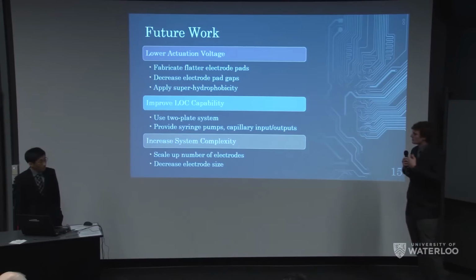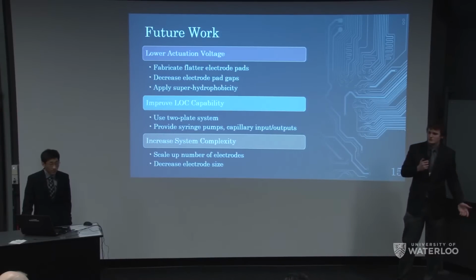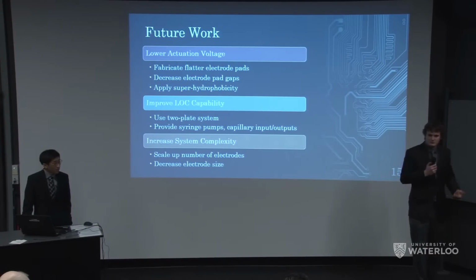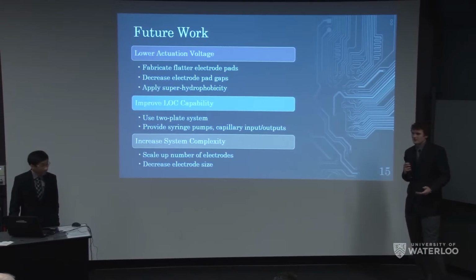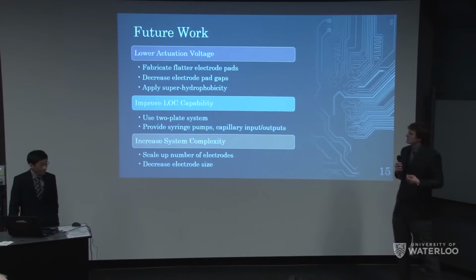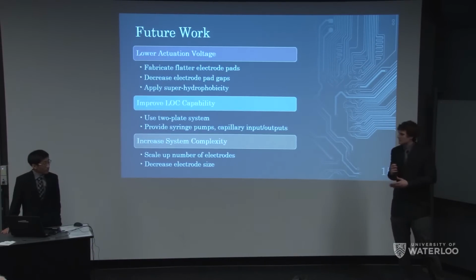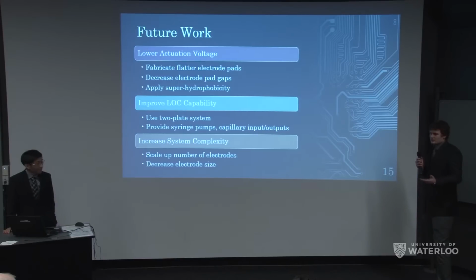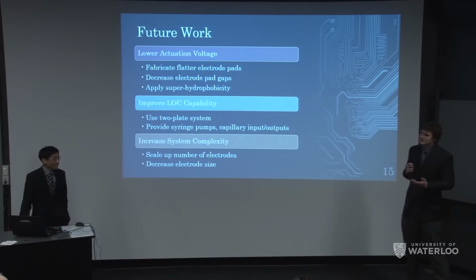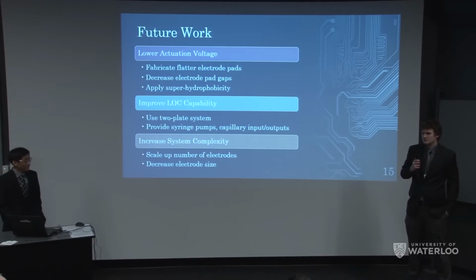And this really leads to, going into this project, we didn't envision it as just making an electrofluidic or an electrowetting device, but we really wanted to start a digital microfluidics platform. Digital microfluidics is the avenue through which we can create custom channels. You can create controllable droplet actuation paths, and further, where we see our platform as fitting is as a way of decreasing the barrier for users to get into digital microfluidics.